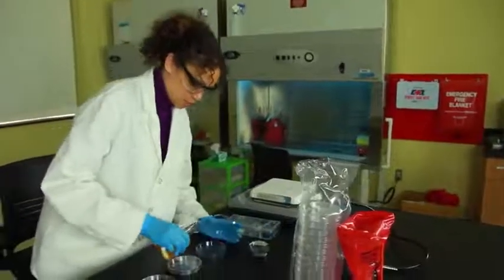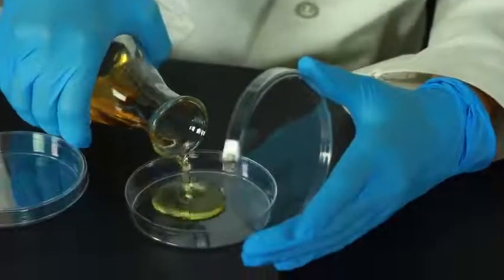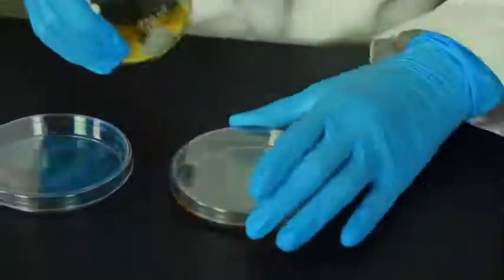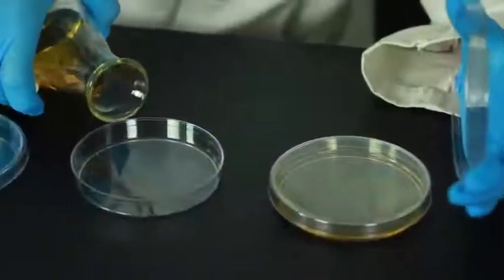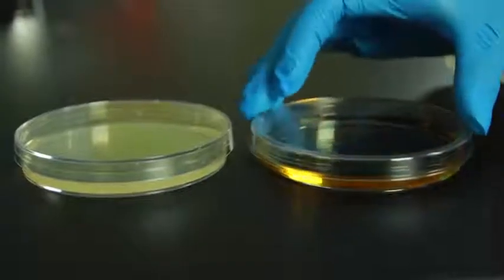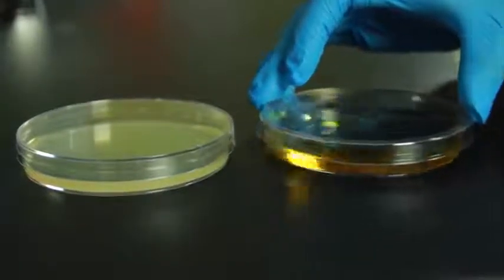Pour the media into the Petri dishes. The amounts don't have to be exact, but be sure to cover the entire bottom surface, which is about 20 milliliters for standard size Petri dishes. Once the media has cooled, it will solidify and turn opaque. Here you can see the difference.